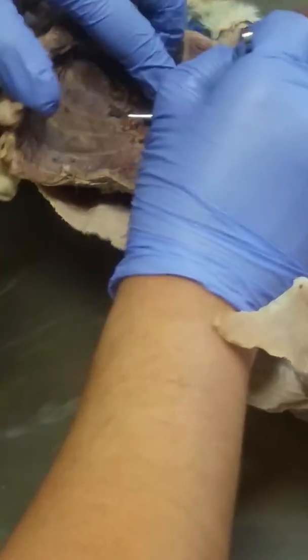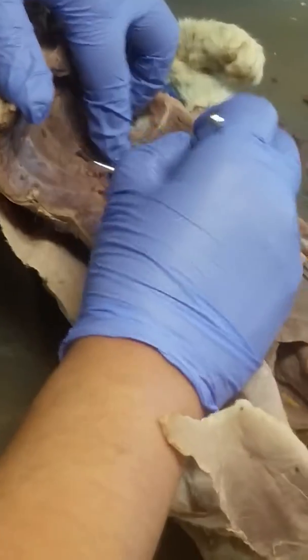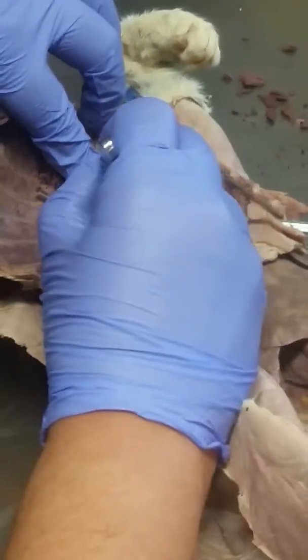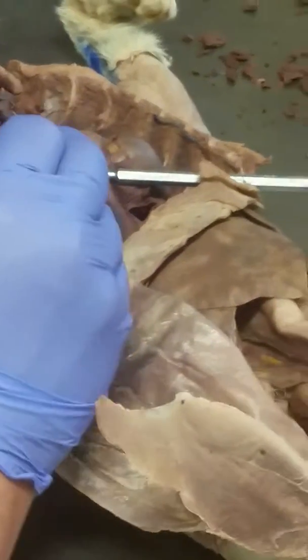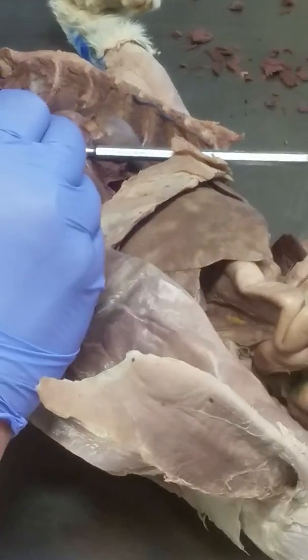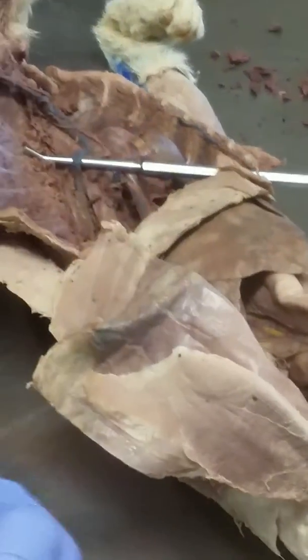If I were to clean this up a little more, you can see that, look, it really is dumping into it. See that? See how it really is connecting to it? It really is connecting to the superior vena cava, and the superior vena cava then dumps into the right atrium. Okay? So remember, the azygous vein is the last tributary that dumps into the superior vena cava.